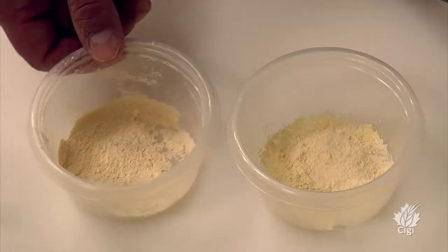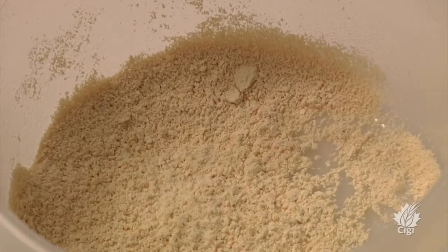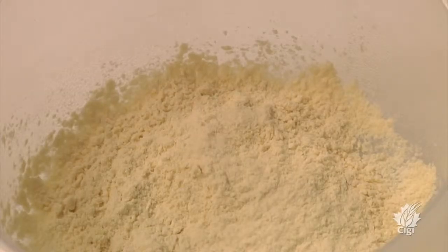So this is the protein fraction, most likely around 55 to 60 percent protein, and this would be the coarse starch fraction.